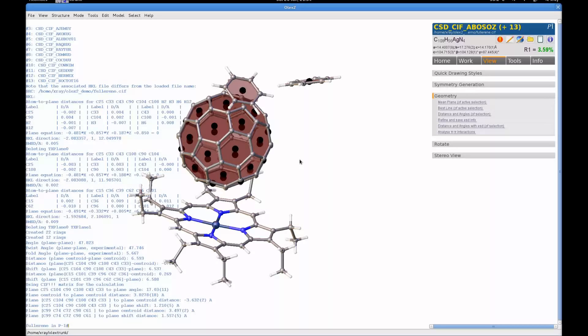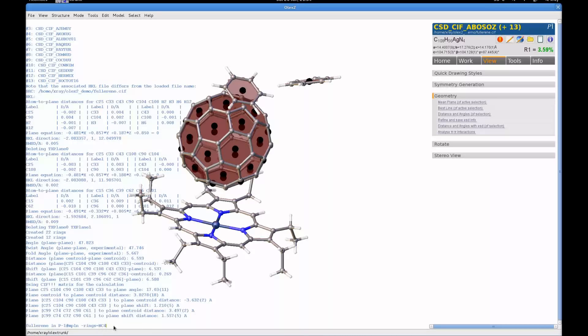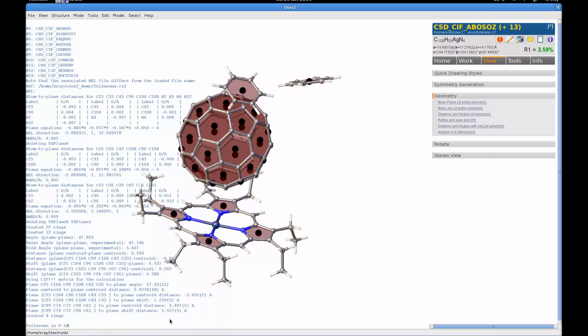What about if my rings don't contain just carbon? For example, if I have in this five-membered ring here, I've got a nitrogen. Well, that's not a problem. I can tell it to select all the nitrogen and C4 rings, and now I've got all the mean planes selected.